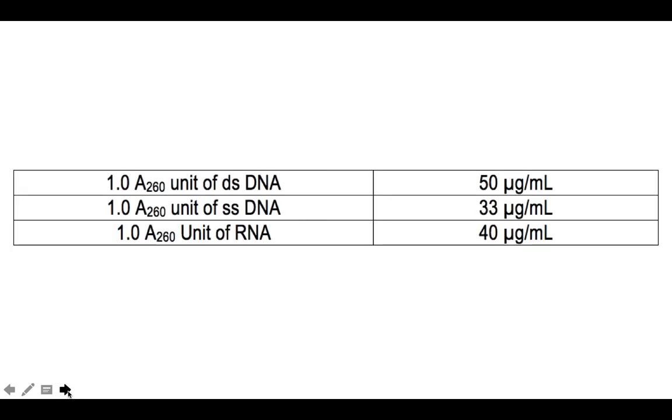All right. In terms of the absorbance of the diluted DNA sample, you have diluted your stock DNA, you computed the dilution factor using the parameters that I have mentioned, and you have subjected your diluted DNA sample in the cuvette to spectrophotometric analysis.